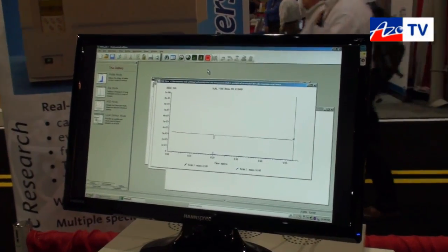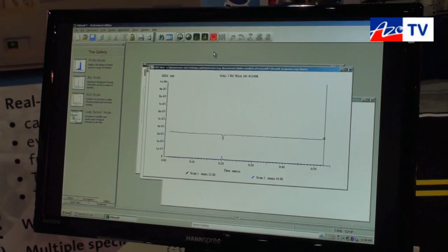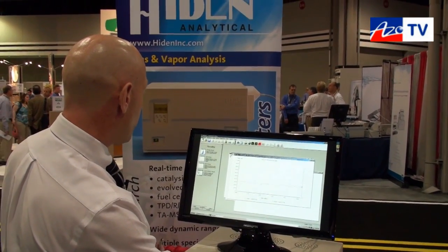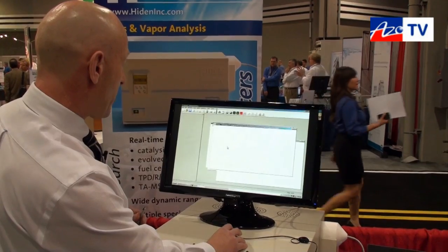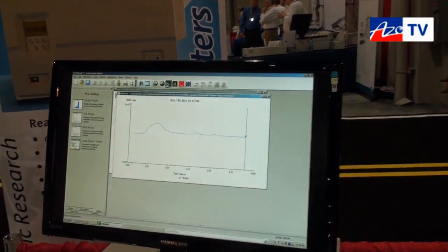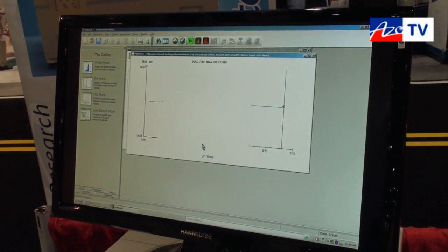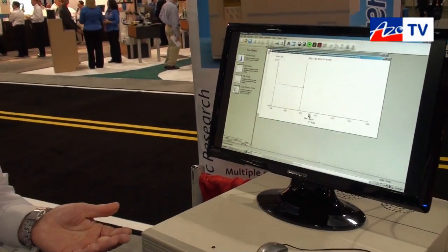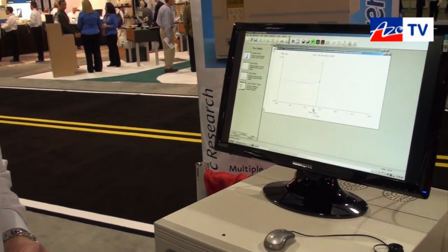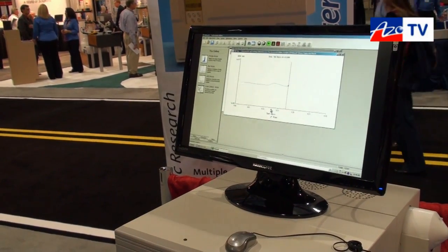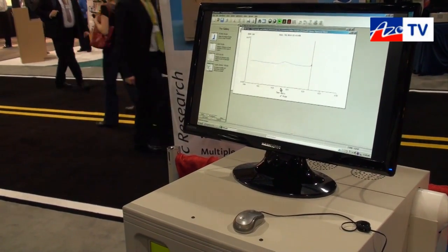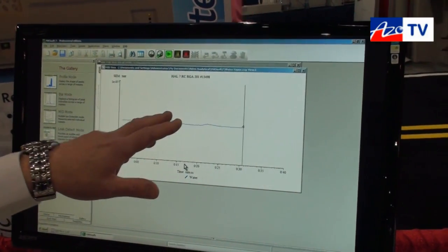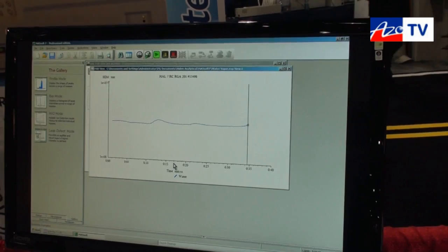One of the biggest issues for users of atmospheric pressure sampling systems is the ability to monitor low levels of water vapour and to see the instrument recover quickly when it's been exposed to water. My hands are pretty dry this morning, but if I just offer the palm of my hand up to the capillary, you can see the rise and fall in response to water vapour. You can see the sensitivity of the instrument, and the nice thing is its ability to recover really quickly when it's been exposed to a condensable like water.